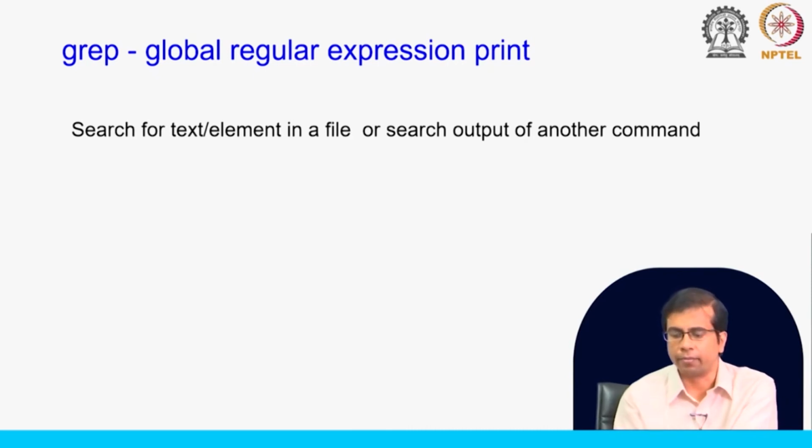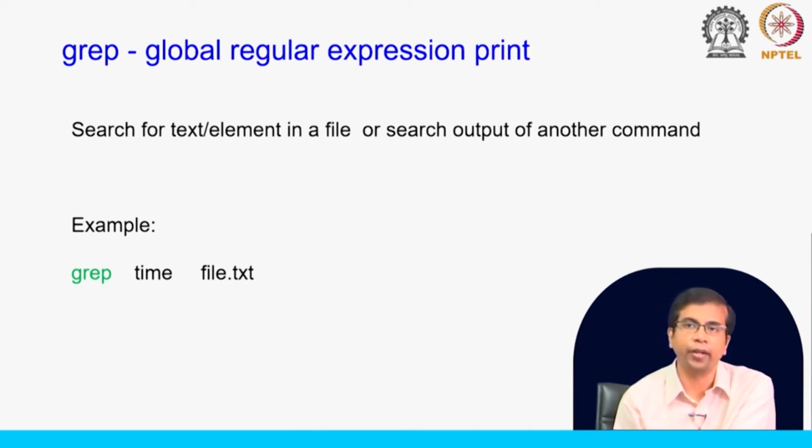We will use this for a very simple kind of task. We want to find a specific name inside a file. For example, we want to find a read name inside a file, or once we have done the NGS data analysis and got the mutation data, we want to look for certain chromosomes. Maybe there are mutations in certain chromosomes that we want to look at, let us say chromosome 5 in the human genome, because that might be useful for certain disease identification, classification, etc. So, this very simple task of grep could be very useful for many applications.